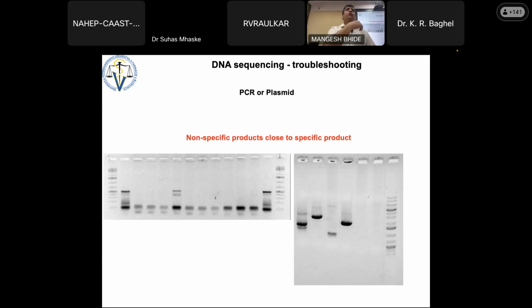We are going to see why it is not there. But I recommend you all never send just the PCR product. First, you will lose money because the company will charge you, and the company will not tell you which product they sequenced.